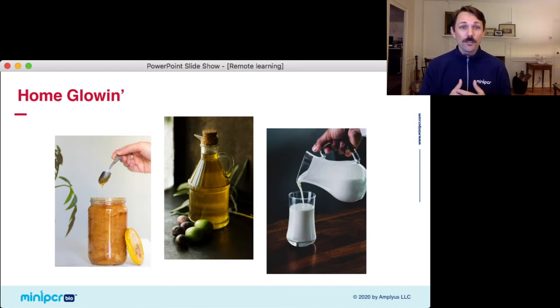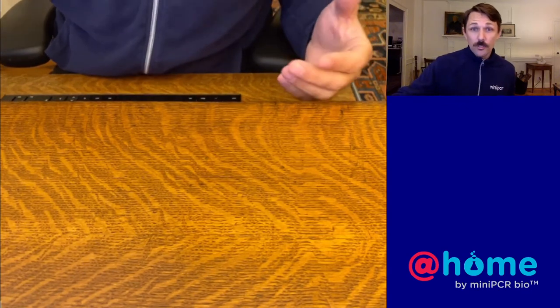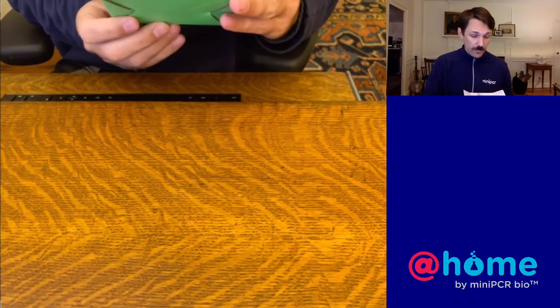But that's part of the goal of the lab. Specifically, we ask students to make observations and then ask a question they can test, and then to test that question. So, for example, from some simple research, I learned that olive oil is supposed to fluoresce, and also that nicer olive oils are supposed to fluoresce more brightly. It's believed that's due to the chlorophyll in the oil, which is something that we're going to talk about next. So I asked the question, do different olive oils and different oils fluoresce differently?